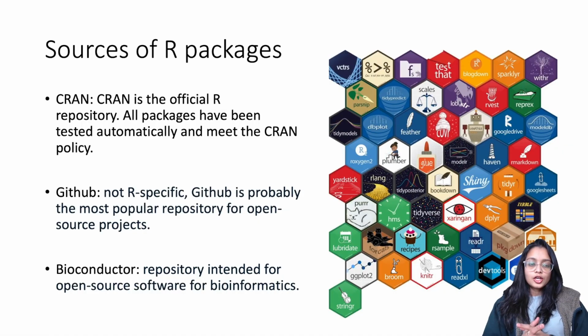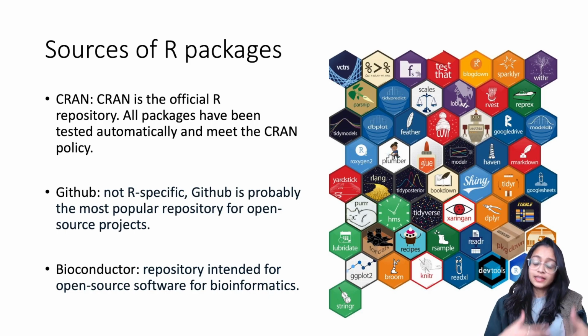So R packages are nothing but collections of code and functions that are developed by the community. And R has extensive support for bioinformatics, in that it has an active community that constantly develops code and these packages for bioinformatics analysis. And that is also one of the reasons why I prefer coding in R for bioinformatics analysis. So these codes that are already written by the community can be leveraged by installing them into our system, and then can be used to perform analysis on your datasets.